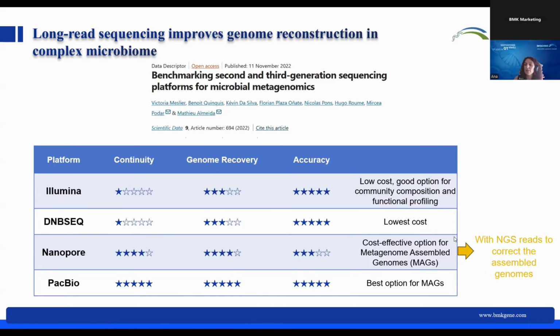I would also just like to add that even if the idea of the project is to do general screening of the taxonomy and the functionality, although short reads are good for this, if you have the possibility of doing long reads, since the context will be longer, of course, the screening will also have a better quality.